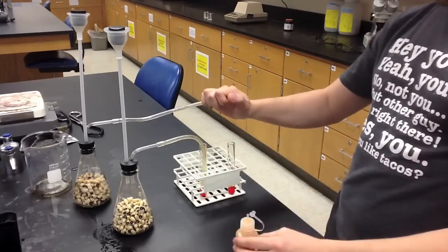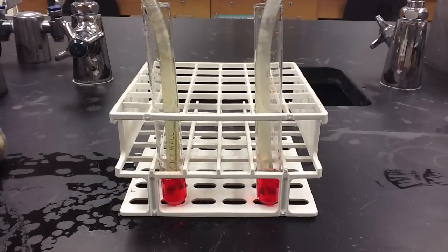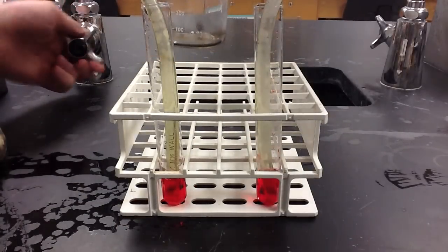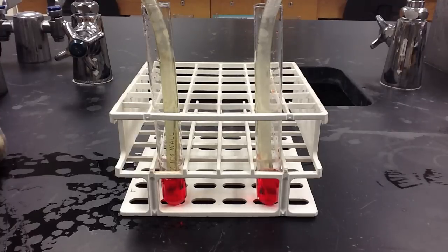Once we've replaced the water in each test tube with phenol red, we're now ready to test for the presence of carbon dioxide. We do so by filling a beaker with 100 milliliters of water, removing the rubber stopper from the end of the thistle tube, and pouring the water into each apparatus. As I pour the water into the apparatus, you'll notice the phenol red bubbling.